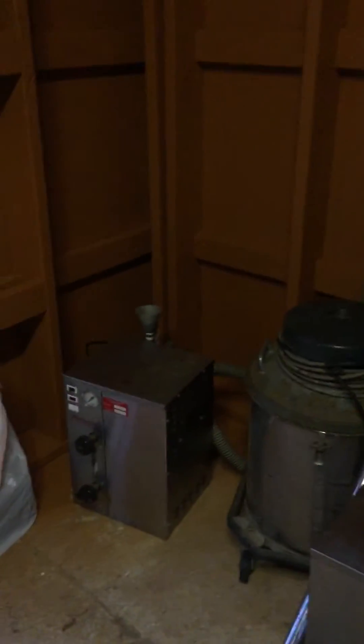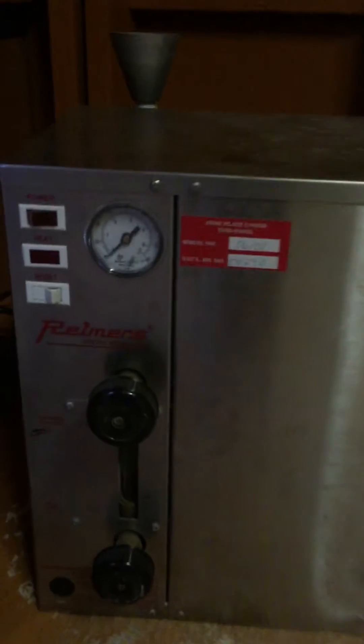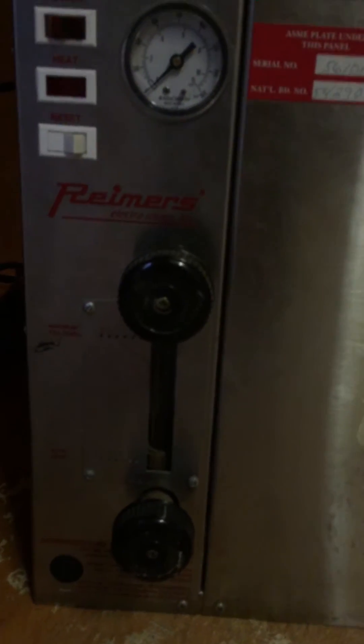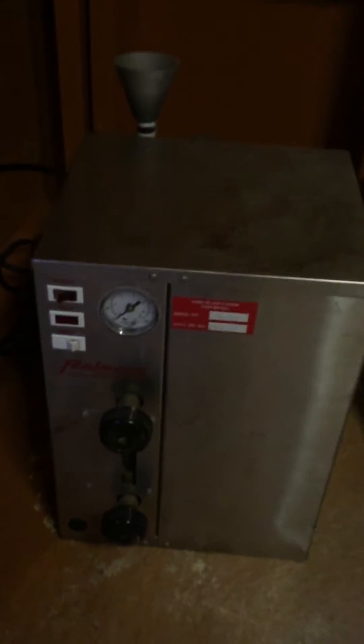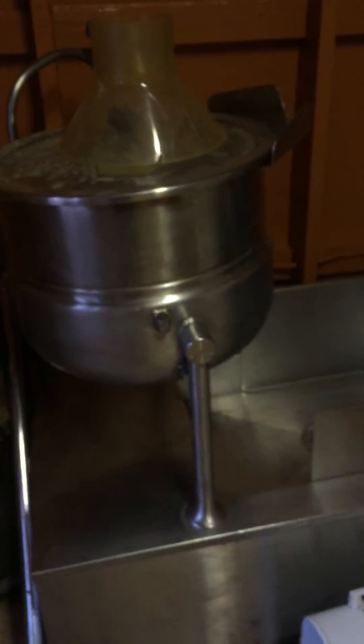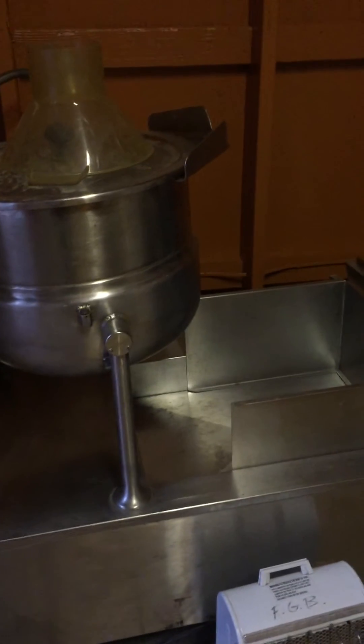We just picked that up the other day. This is the Reimers JR, model 1.5 kilowatts portable steamer. We've tested it out but we need to get a new valve right here — it looks like it's leaking a little bit down here. So that's gonna power our steam jacketed kettle.